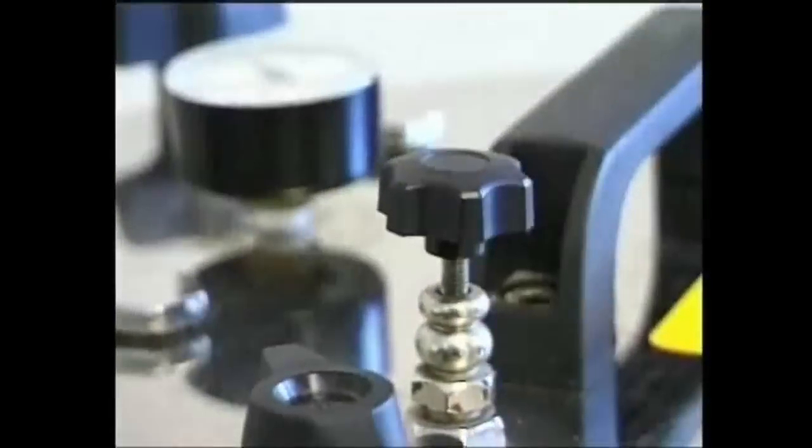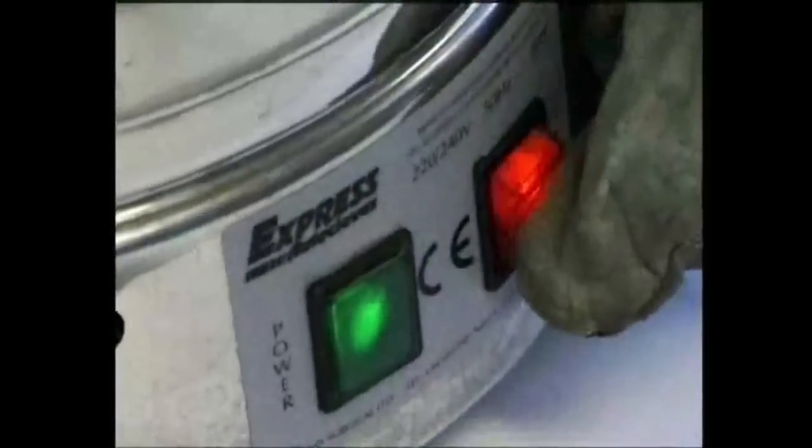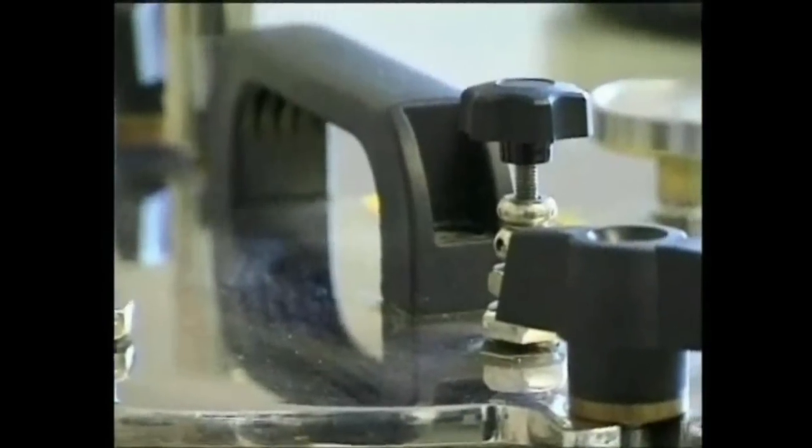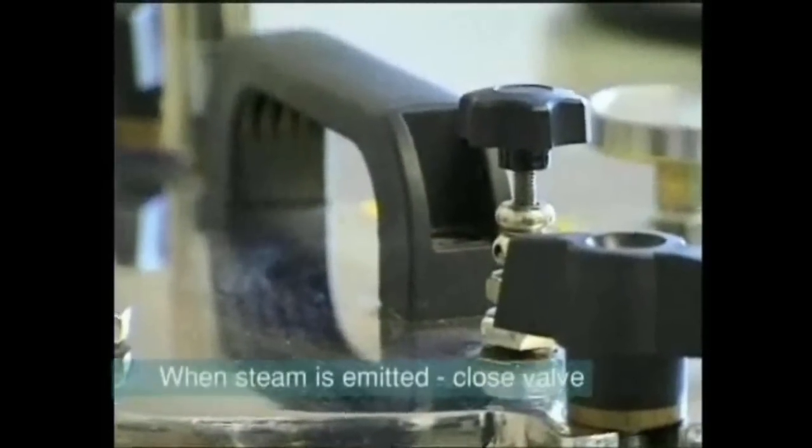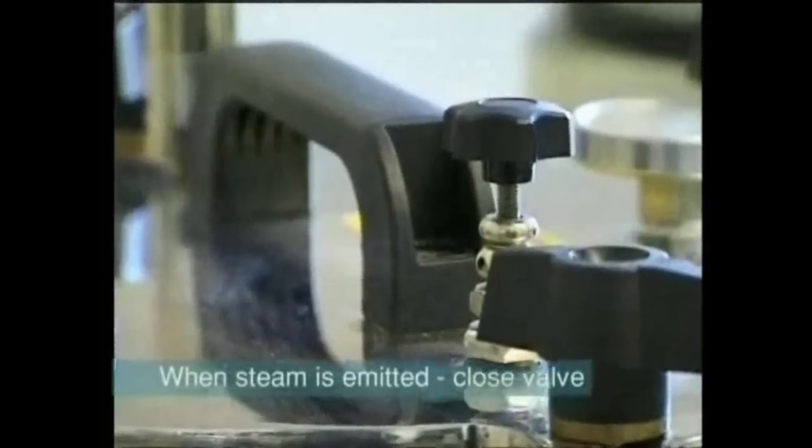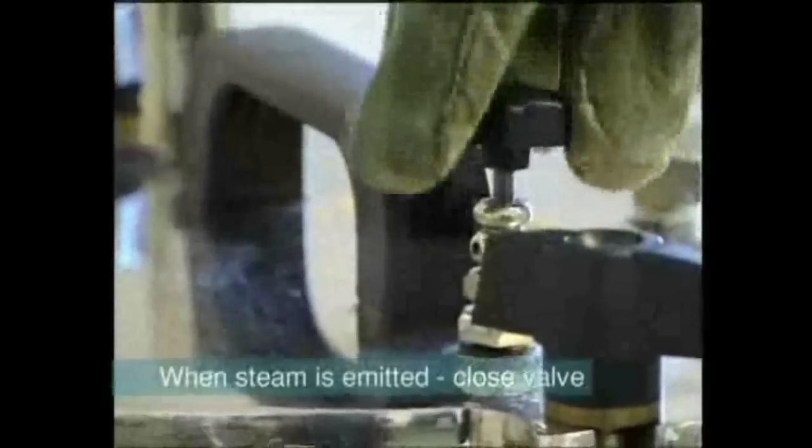Given sufficient time, the high temperature steam inside the autoclave will denature the proteins of any microbes and their spores and therefore kill them. It's important that the steam can reach all parts of the equipment to be sterilized and that enough time is allowed for the heat to penetrate to the center of whatever is in the autoclave, for example, flasks of broth.